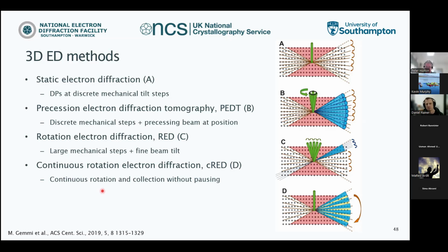This is only possible since we now have very fast detectors, because without a very fast detector, only what's indicated here, the blue part, would be collected, and then there would be dead time, again a loss of information in between, where the detector would be read out. This is essentially zero with the detectors that are currently available. There's essentially no loss of information, and this makes it the most widely used type of technique within 3DD. This is also what's used on our instrument.